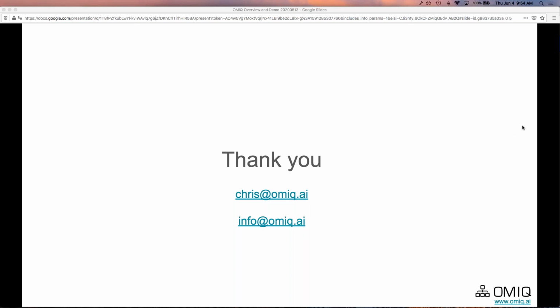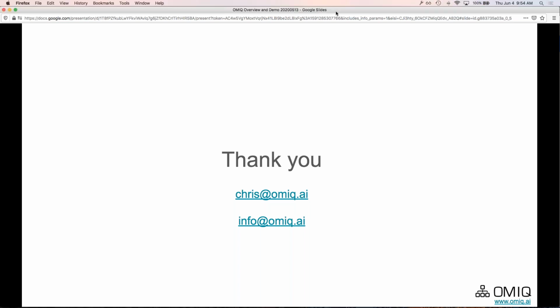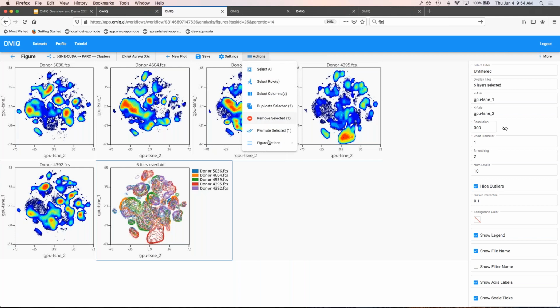Currently, yes. So, there's kind of no way around needing to have an account, but we do have functionalities for reporting. So that's one thing I didn't show, is that you can very easily sort of make any figure and then export it as a PDF. We also have this interesting batch reporting tool. So if you've done a very large analysis across a lot of samples, you can export, for example, like a 50-page PDF with all of your analysis done automatically. We do offer collaborator accounts and flexible licensing schemes for this sort of thing. So you'll just have to get in touch with us for your situation.